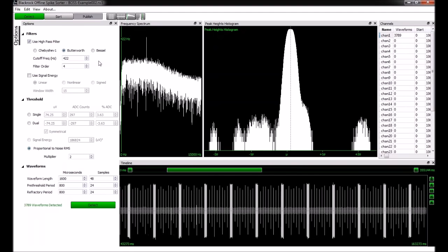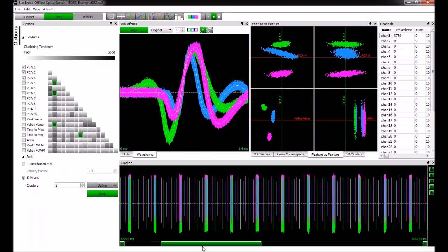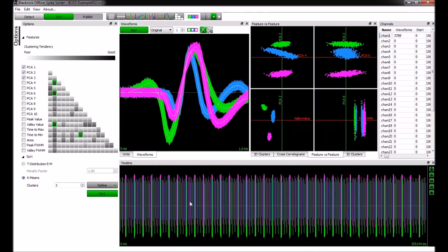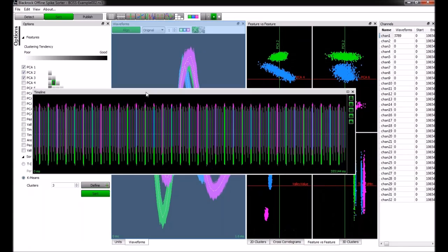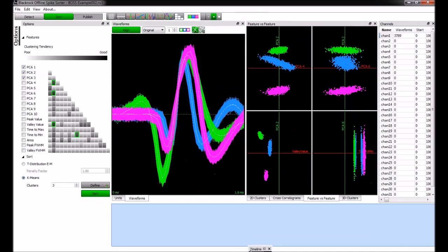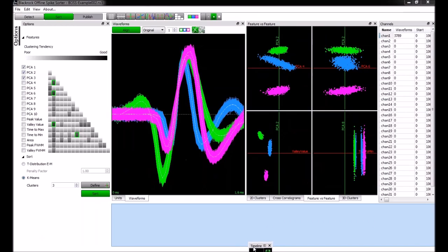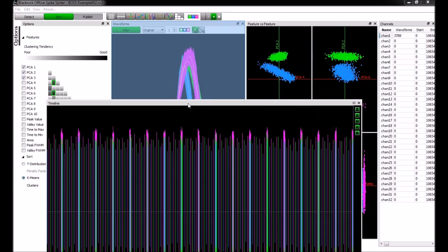And also, the question was, can you adjust the timeline window width or any of these window widths, what you just did? Can you make it even wider by undocking it and moving it? So you just mean extend the timeline? Yes. So you can pull the timeline out, I can move it to a different monitor, and I could make it basically as big as I wanted. So I could just pull it out here, for example, and look at it really large.